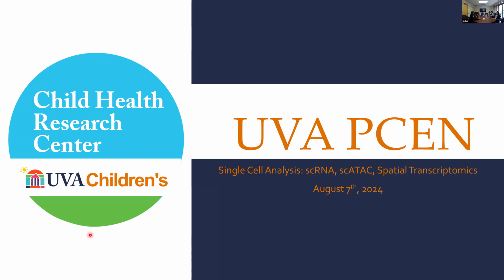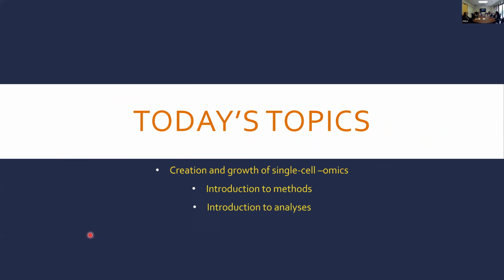Okay, so today I'm basically talking about the different types of single cell analyses that we have. I'll touch on when all these technologies first came on board and how rapidly they've been adapted. Then I'll go into what methods are available to generate these types of data, and then touch on a typical overview of what an analysis looks like, with some examples along the way. So that's the topic.